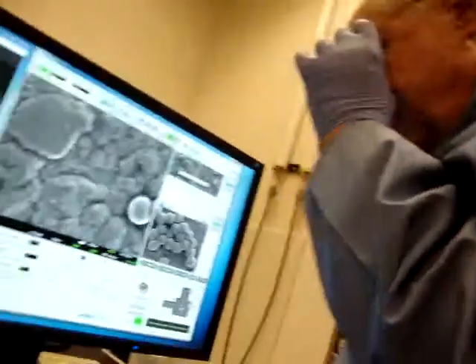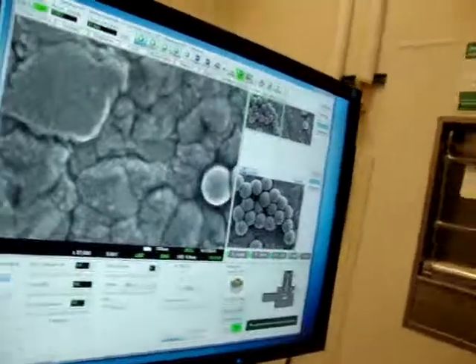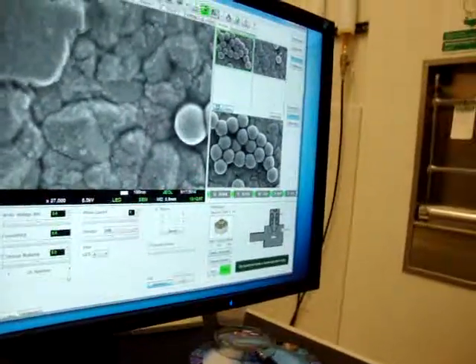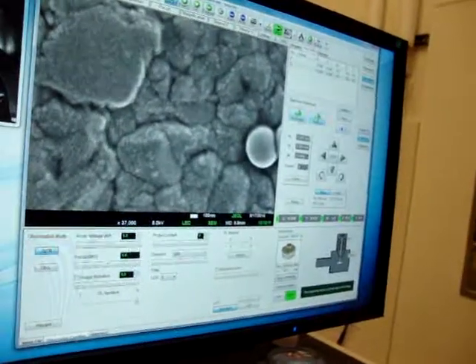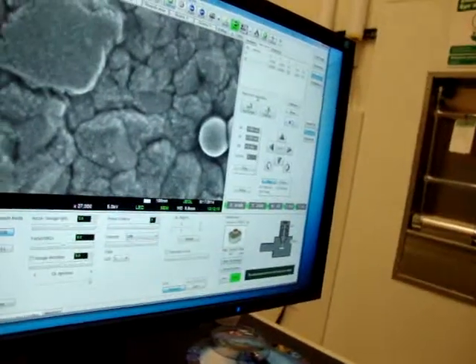Anyway, we can figure that out later. It's a luxury, you click on it, but it's okay. Where's the mouse? Step control. You can tilt and everything through the software? Yeah. Okay.